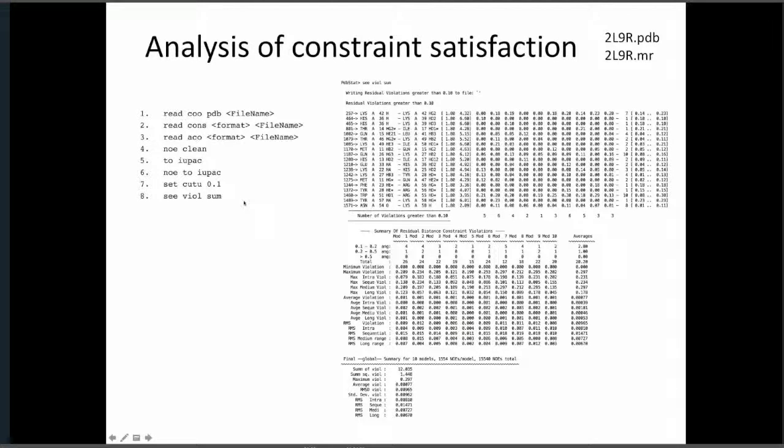That is what we came up with in the best practices. And this also was asked for by some people at the PNNL labs, who needed to do this with a huge amount of models, and they wanted to see this general global summary for all the models. So you can play with this one, and you can distinguish. It will point out whatever violation is really big. It will point out which one it is, so you can go back and forth between the NOE file and locate that restraint and make sure that it's okay or it's not okay.